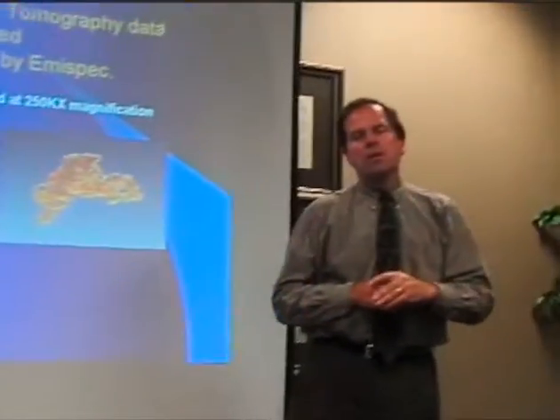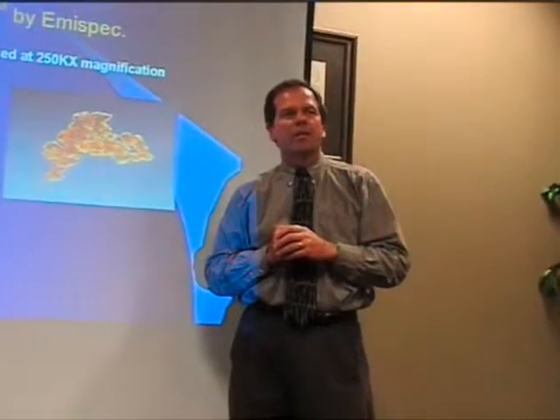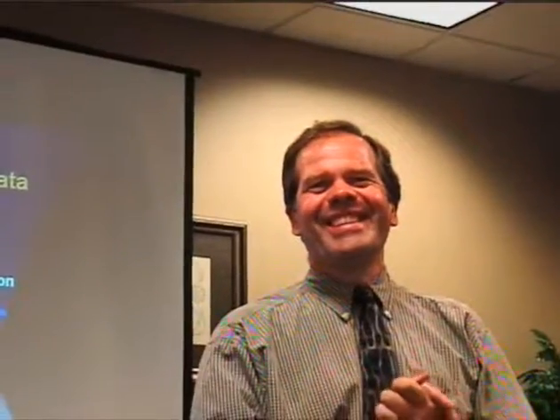When you showed the picture of the nanotubes, how do you know that bright part is real particles? Well, by experience in TEM, that's what they look like. Talk to my colleague over here, Dolly. He can explain this.